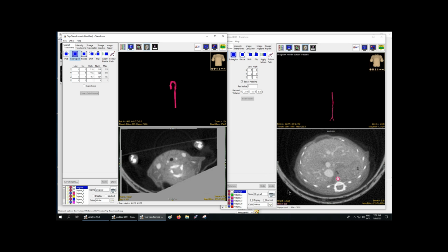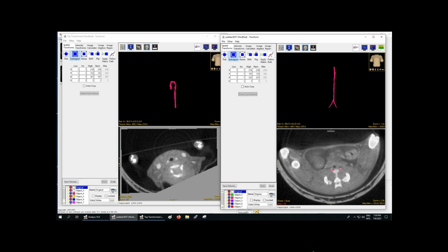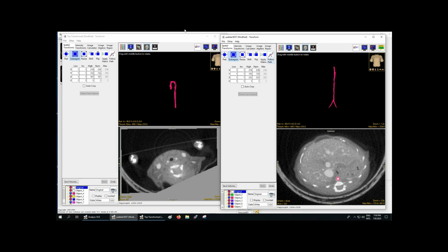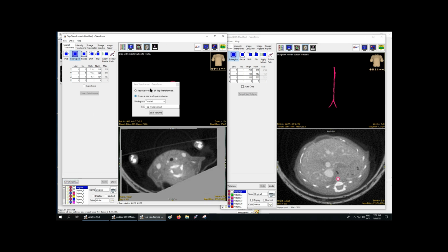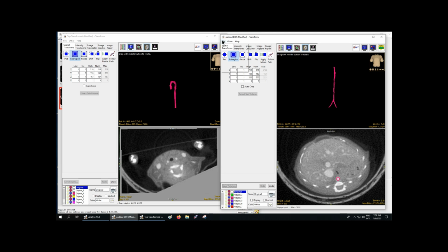And this was 223. So we're going to subregion this to 222. So subvolume. See if there's anything at the bottom. And there isn't. Perfect. Now we're going to have to save this volume, create new workspace volume, top transformed subregion, subvolume, padded bot subregion, and we're going to have to save their corresponding object maps as well. Current directory, subregion, and here as well.